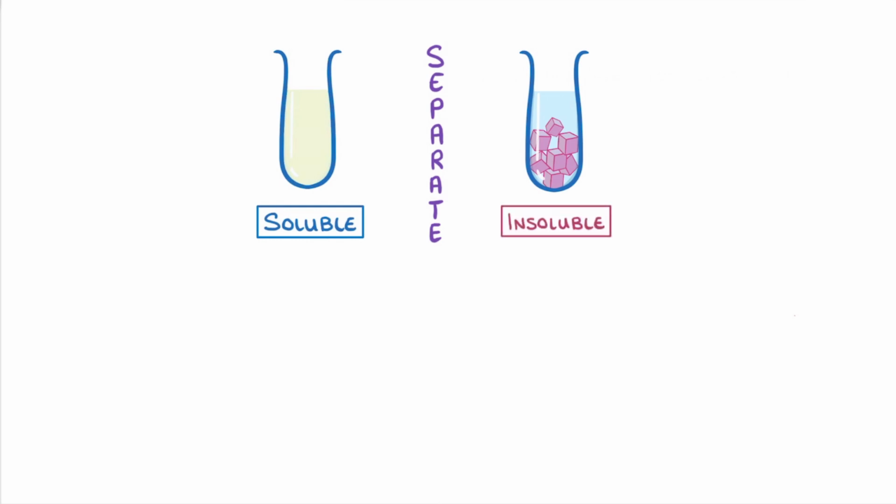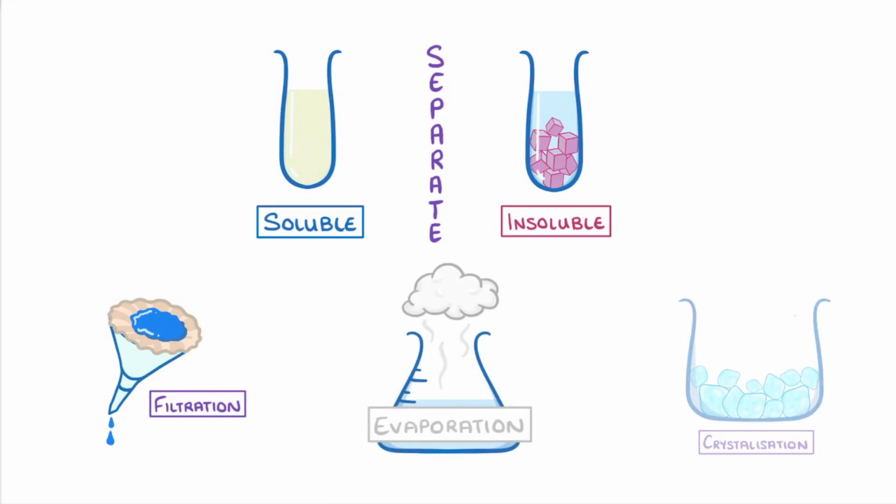In today's video, we're going to look at how we can separate both soluble and insoluble solids from liquids, using techniques such as filtration, evaporation, and crystallization.